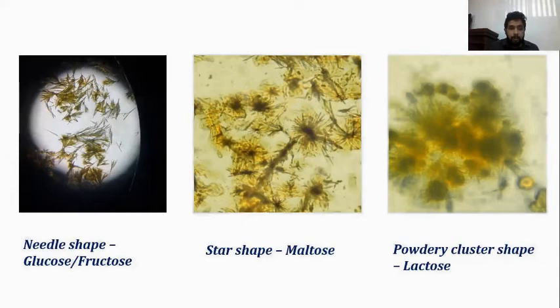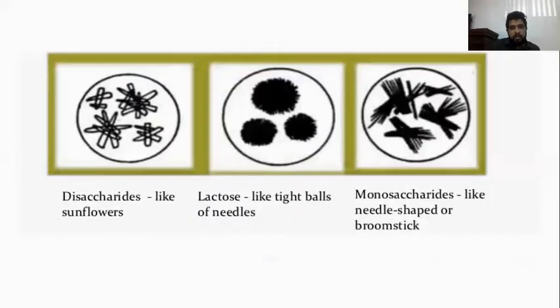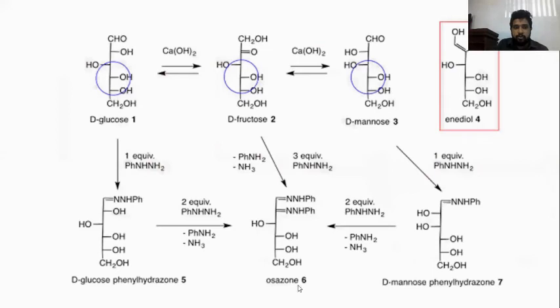Fructose, yes. Then the reducing power of fructose is higher than that of glucose. See, this is glucose and this is fructose. The difference between glucose and fructose is that glucose has a secondary hydroxyl group while fructose has a primary hydroxyl group.